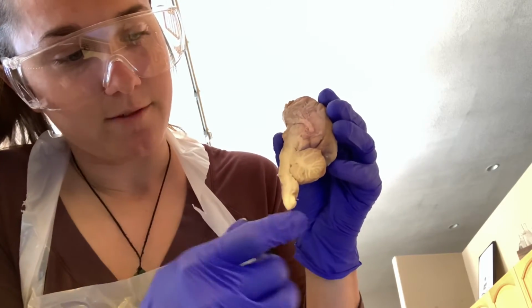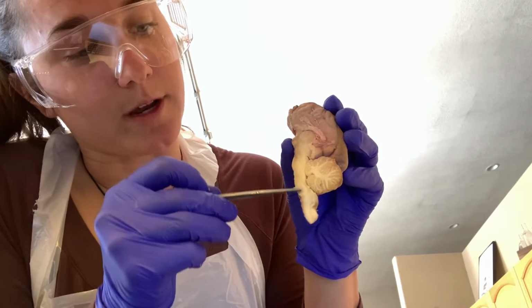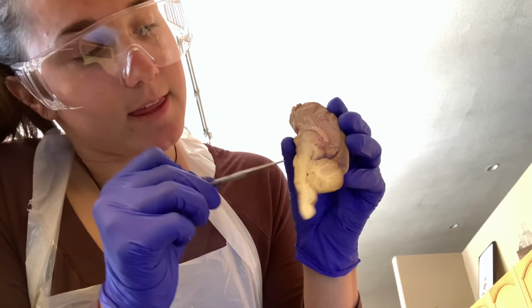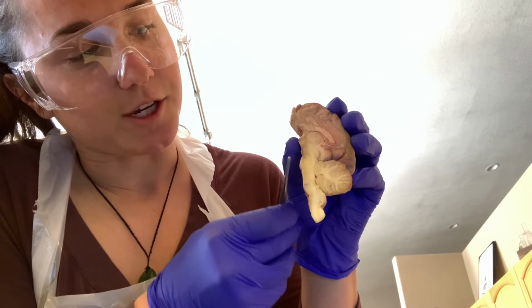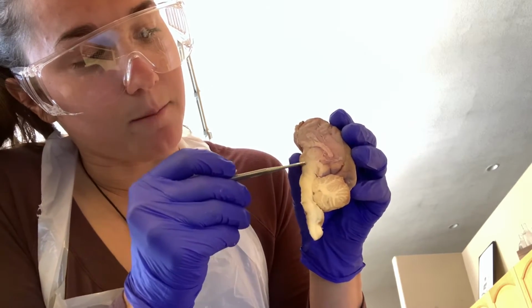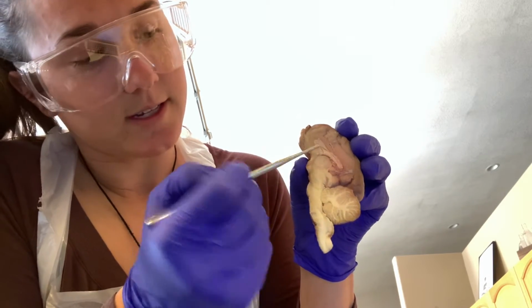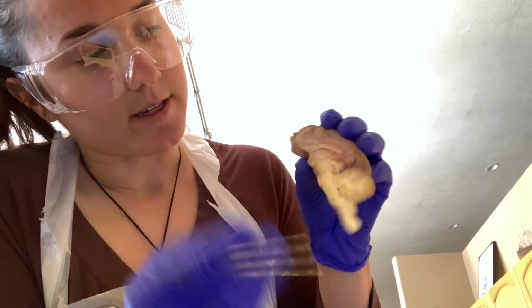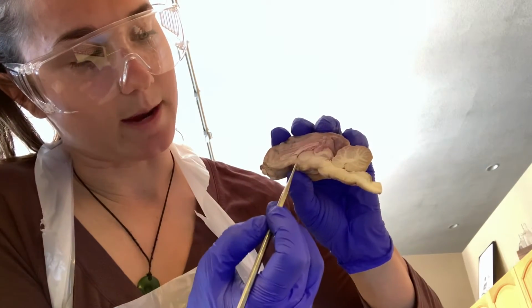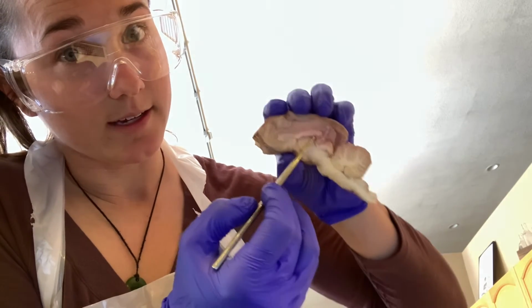So here at the very, very bottom would be the spinal cord, and as we move our way up would be the medulla oblongata. This little protrusion here would be the pons, and then as we move up we have the midbrain, and then this circle here, this is the thalamus. And then underneath the thalamus, as the brain looks this way, would be the hypothalamus. This up here would be the pineal gland.